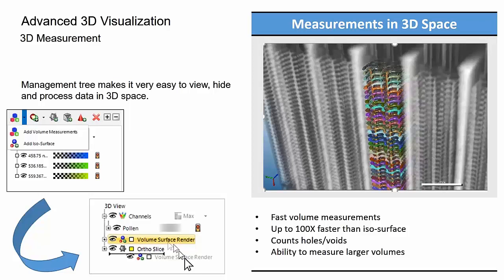And then here on this data tree, if you look at the 3D view, it's a very, very straightforward tree that goes from a priority top to least minimum bottom as far as its order, and you can click and drag in order to have either an iso surface of a particular segmented object as the priority or not.